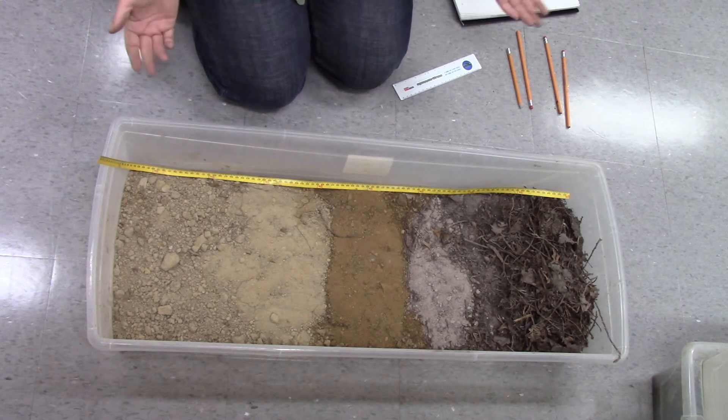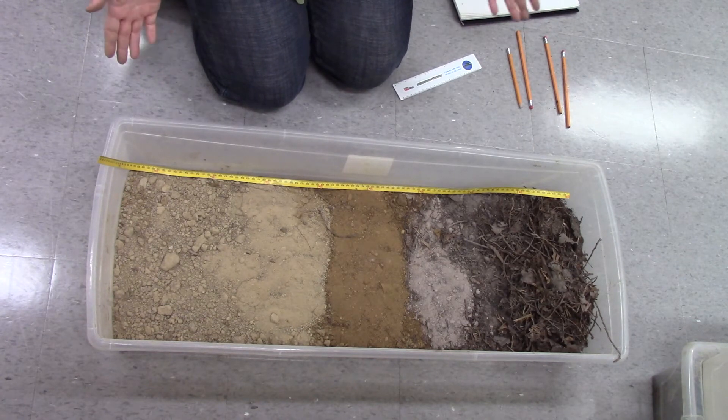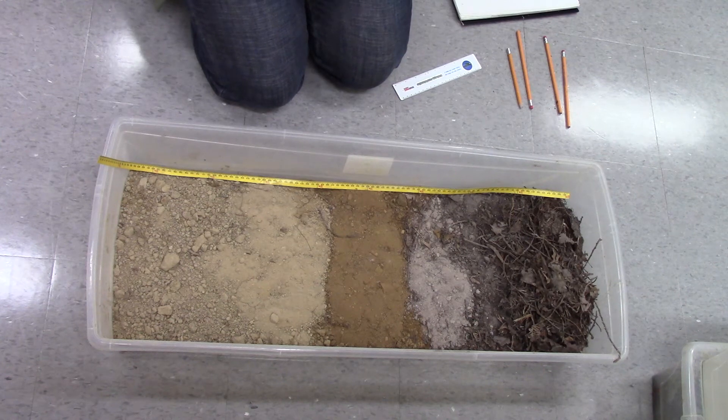Here's an example of another soil profile in the lab. This one is a fairly easy one to ID. There's a lot of diagnostic layers here that are very distinctive.